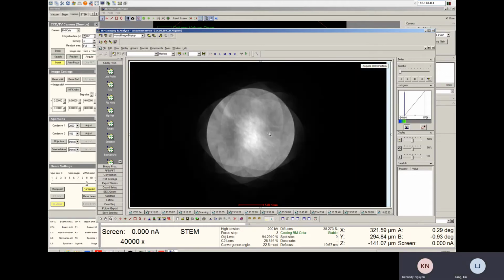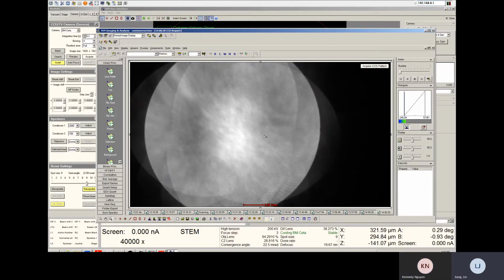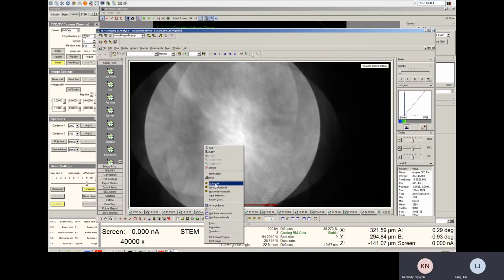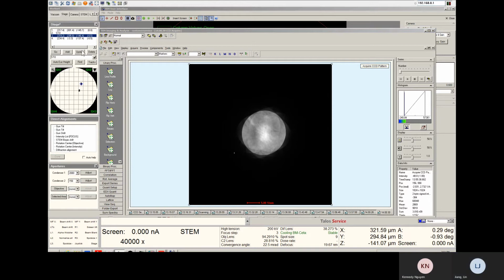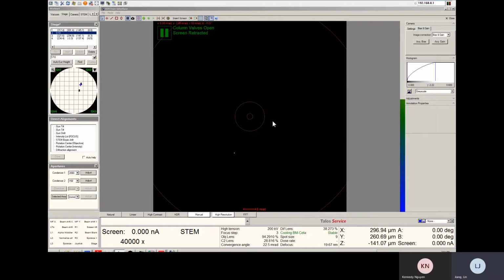Cool. Then there'll be different information here, right? Mm-hmm. You see the strain. Okay. All right. This is how we take it. Actually, pretty good. Okay. Maybe we can switch to the different sample. Go to the STO sample, go there, and take a look at how the convergent beam electron diffraction looks.